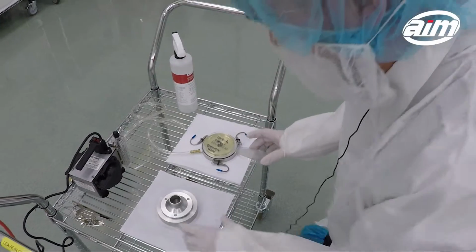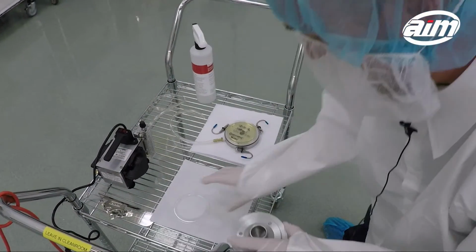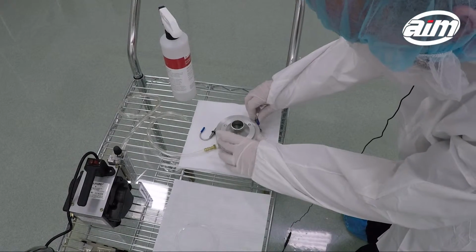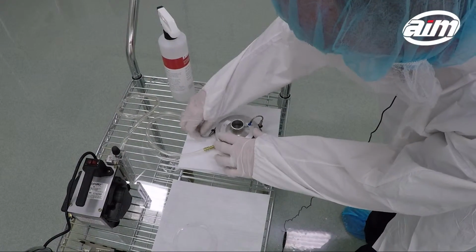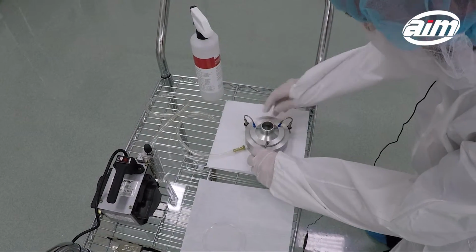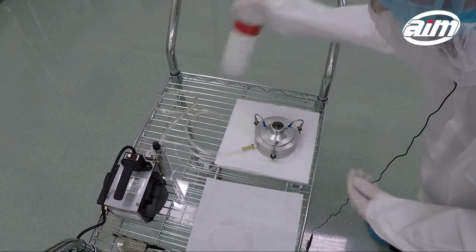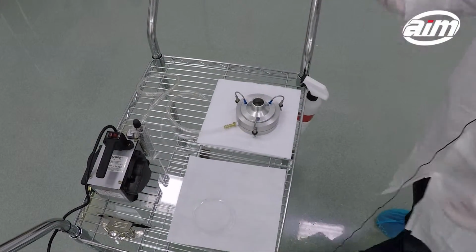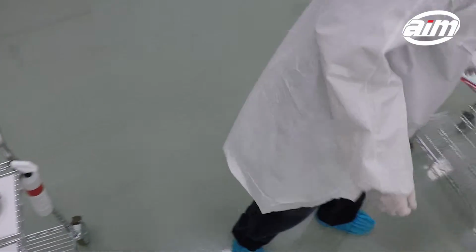Remove the lid covering the sample medium. So now the agar plate is in the housing. I put the little hold downs on it. And it just freely draws the air onto the plate.